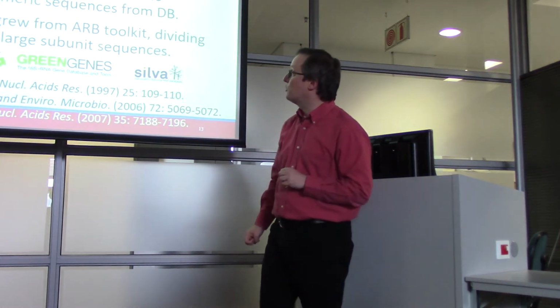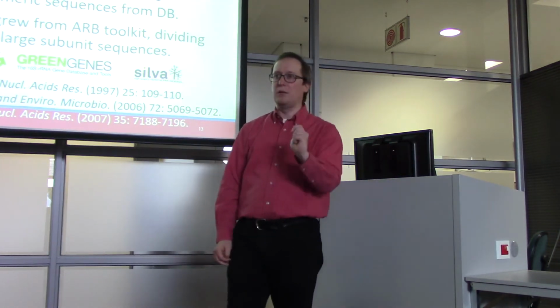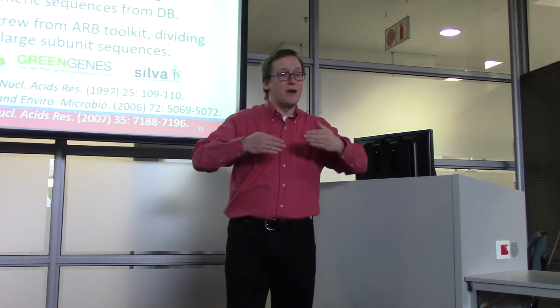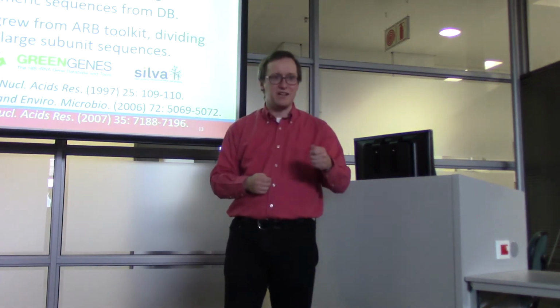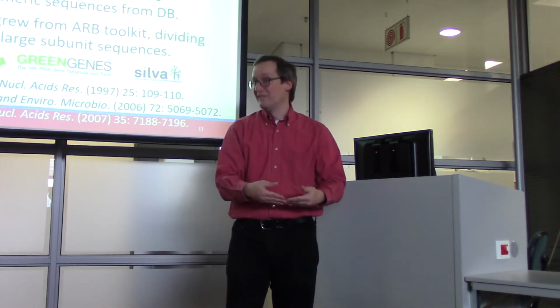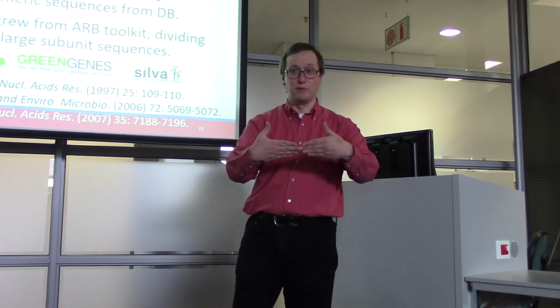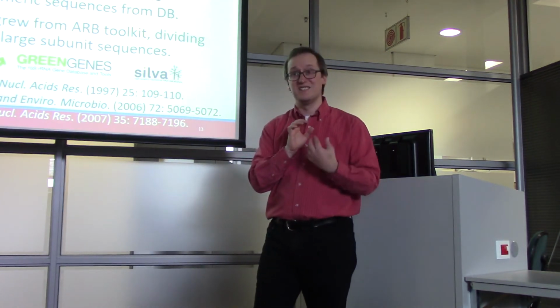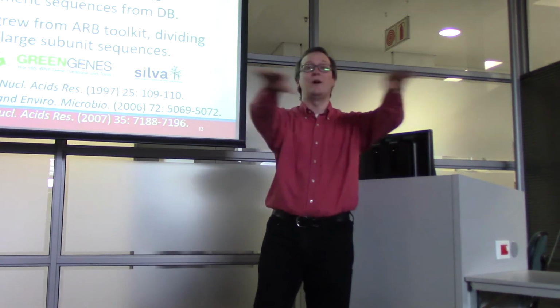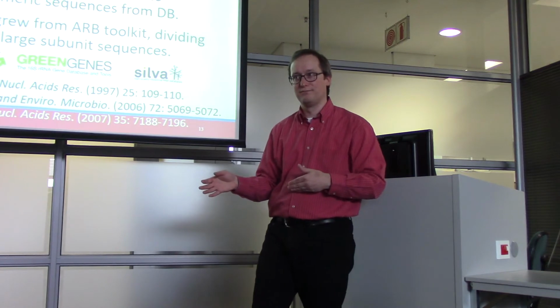Greengenes, however, is also quite large. They have also been concerned about this problem of chimeric sequences. We already talked about why it's bad to try to do clustering when you have chimeric sequences present. Imagine if your database also has chimeric sequences present. That's a big problem. Now you may mislabel a species A as species B just because a chimera for both is present in your reference database. So doing a good job at curating these databases is necessary to protect us when we go out there using Greengenes from misclaiming that one species is actually another.